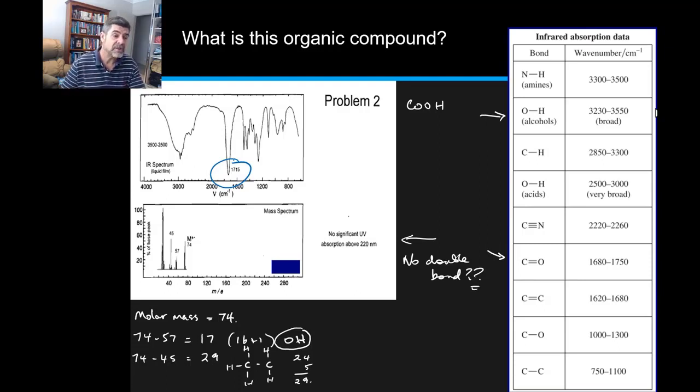So now I'm starting to be a little bit more confident that I might actually have a carboxylic acid here. Now, what I can do since I've got both of these outputs together is just do a quick calculation.